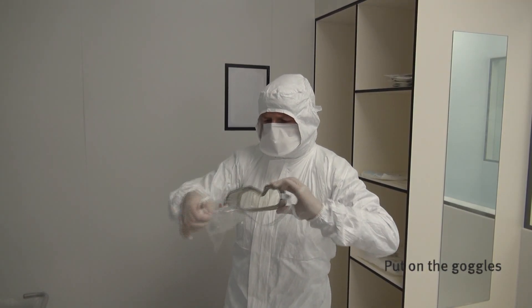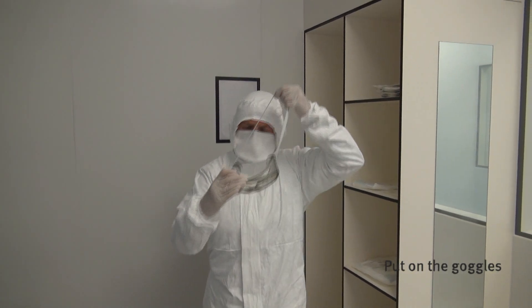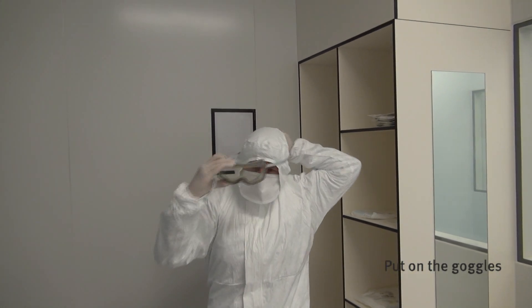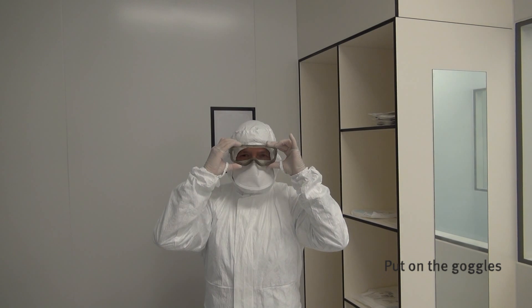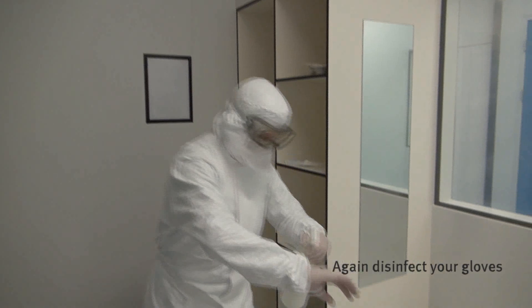Put on the goggles. Be sure the goggles cover your face completely. Again, disinfect your gloves.